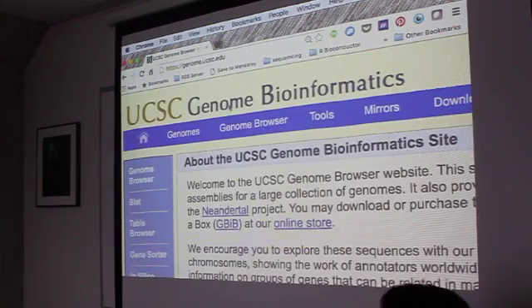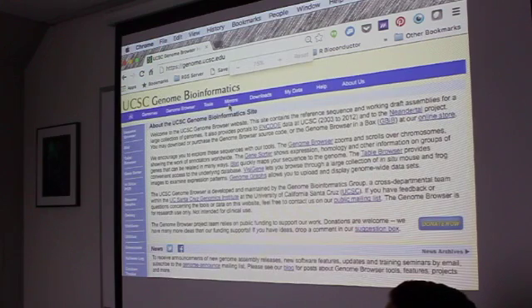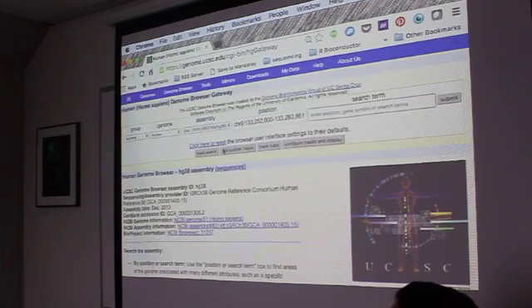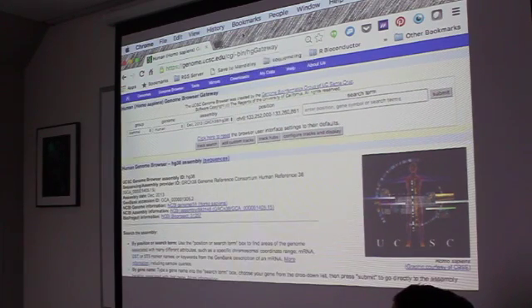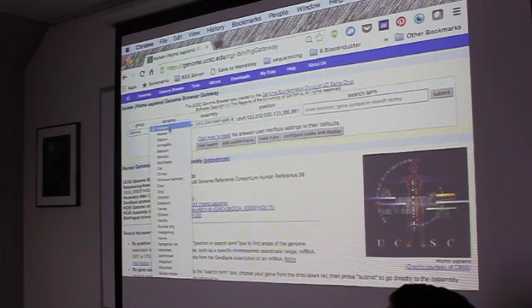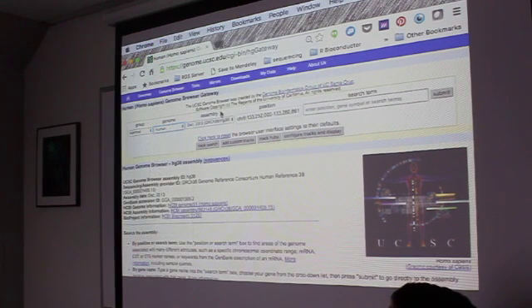Okay, so this is your Genome Browser. It's hard to fit everything. The way you can download things is, you can choose your group. Normally we work with mammals, so human, mouse, whichever organism you're working on. And then this is an important one.